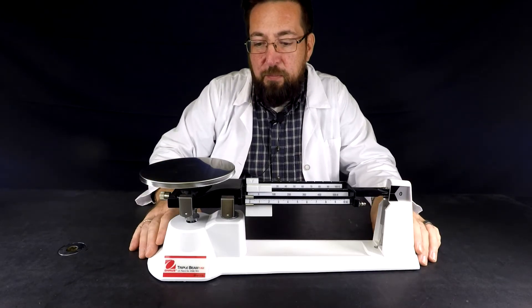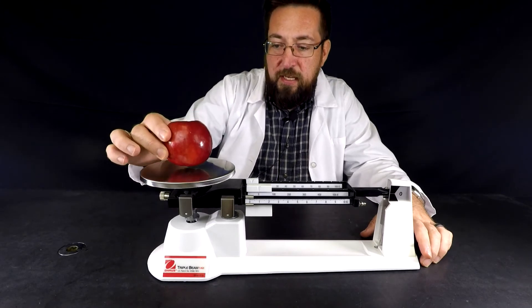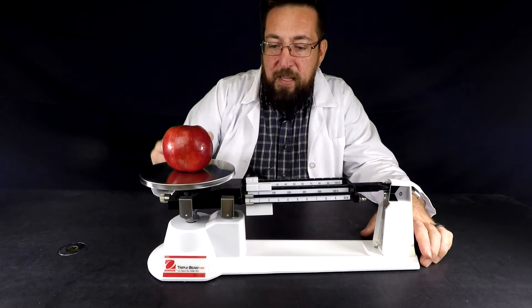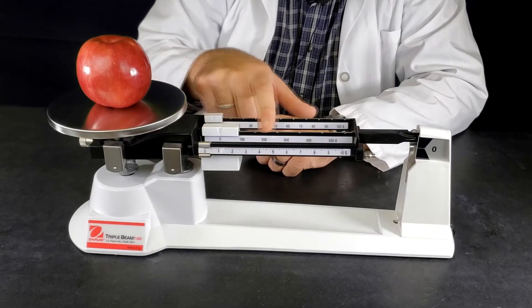So now that I've got it set up correctly I'm going to take the object that I want to find the mass of and set it on the pan. I have three different riders that I'm going to slide. The largest one is the hundreds.